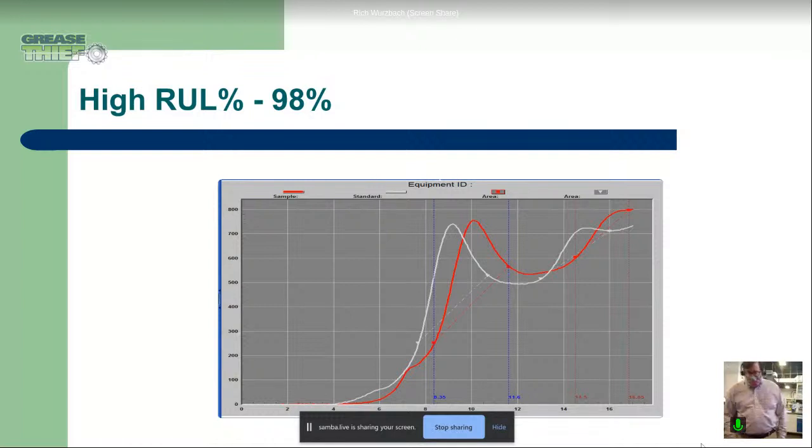These peaks do not quite line up exactly. There is what we call spectral shift or peak shift. And you can even see a little bit of appearance maybe of a small third peak off to the left. Maybe that's our ZDDP there that we haven't really quantified in this example because it's relatively small compared to the other two peaks, which are the amine and then the phenol. But amplitude-wise, they're still very close. We get a calculated value here of 98.